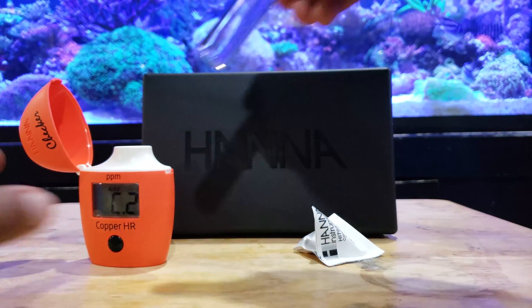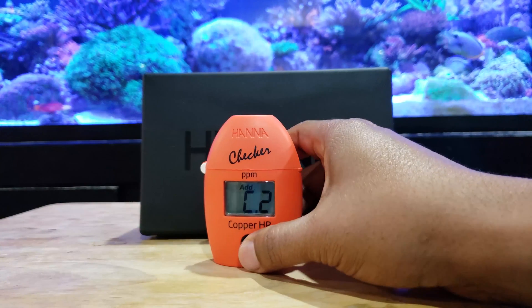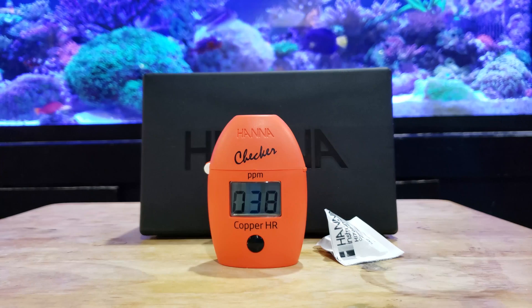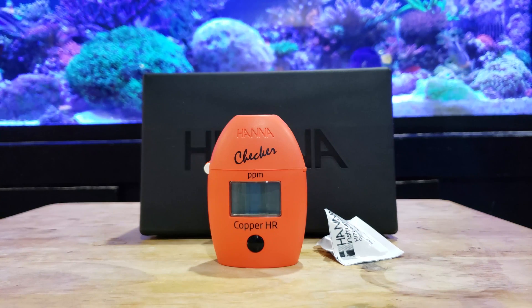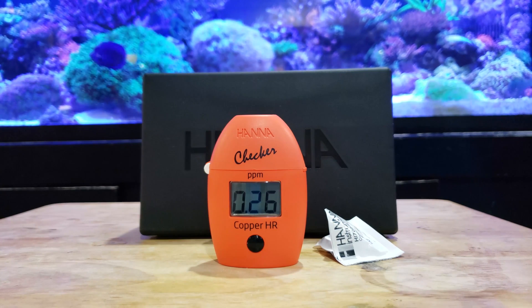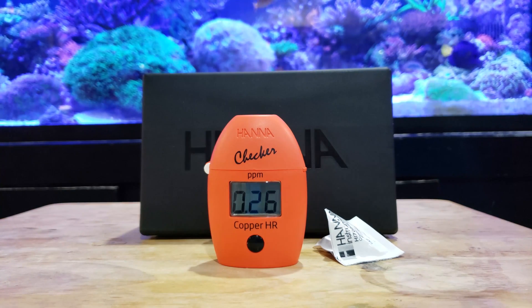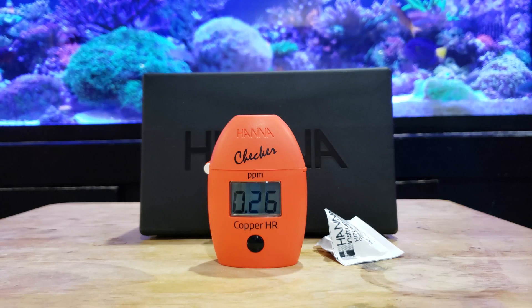Once you get the reagent into the vial, go ahead and shake it for about 15 seconds. After you shake it, put the vial back into the tester and hold the button down — make sure you hold it, don't just push it. Hold it down until the meter starts counting, and it takes about 45 seconds for the test to be completed. My test came up with 0.26 parts per million. This is right around where I want to be — it tells me my dose is correct and I have half the therapeutic dose of copper in my system. As the instructions say on the Cupramine bottle, you want one dose one day and then the next day put in the second dose, and that's how we test copper these days.